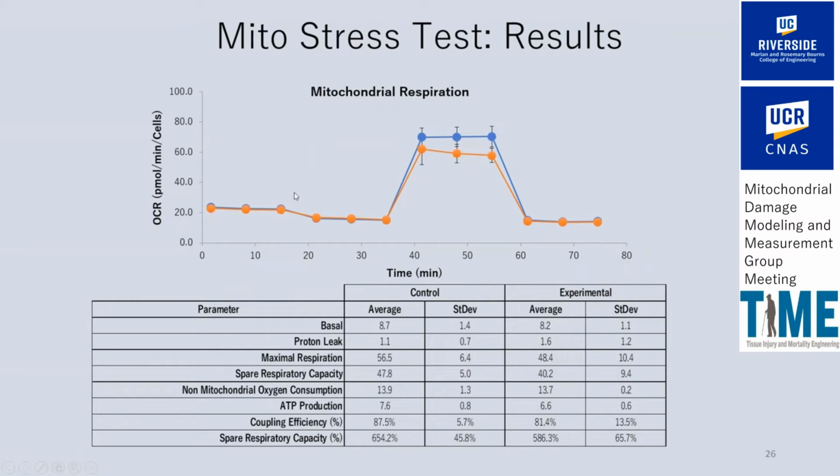Here are our basal readings. Oligomycin is administered here. Oxygen consumption drops. Then FCCP is administered. Oxygen consumption increases. 3 additional readings are taken. Finally, rotenone AA is administered, and oxygen consumption drops again. And overall, the data you'll get is something like this.